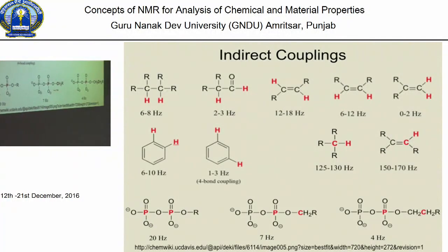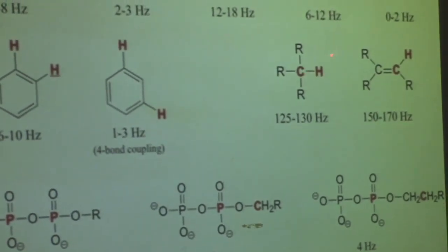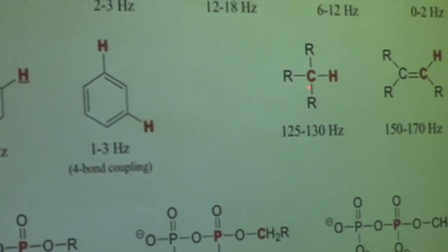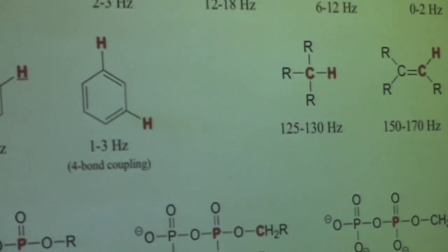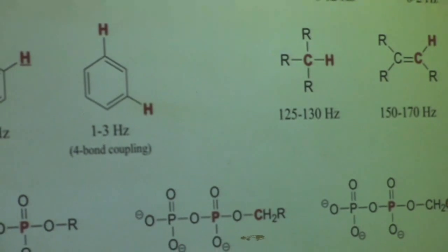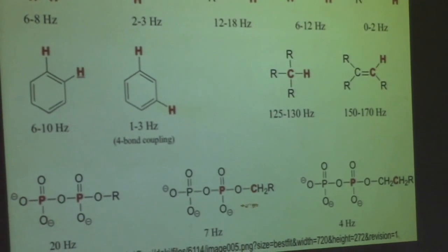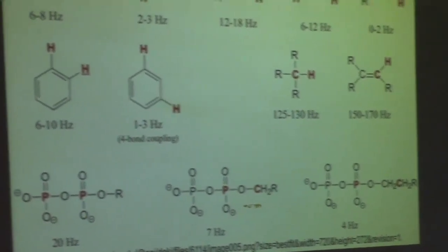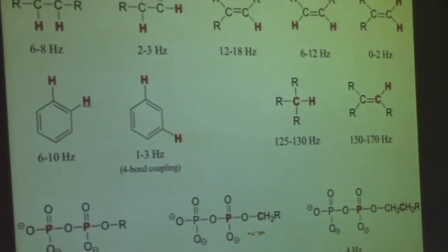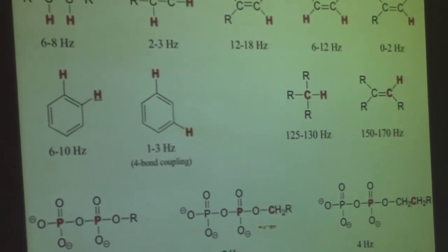or other values. It's too bad there's not a picture that has CH2 groups and CH3 groups, because these heteronuclear couplings, proton carbon for CH, CH2, CH3, differ significantly enough to exploit them, so that one can design NMR experiments that allow us to look at the carbons that are only bound to CH, CH2, and CH3. It's a very famous experiment, the DEPT experiment. For those who have heard of it, I'll show you spectra for that. But we see there's a variation also in the heteronuclear couplings that one observes.